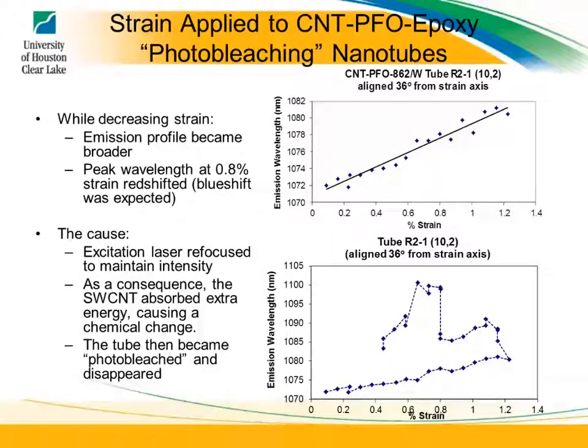Prior people actually put nanotubes into PMMA solution, and they did a study on that, and they saw hysteresis on all of them. A little bit of hysteresis. So if I brought it positive and came back this way, I should be able to bring a negative and come back again. And there's a little bit. That's one of the other things about detecting strain using nanotubes. You want to have a material where if there is any hysteresis, it's almost non-existent. You want to try to limit the hysteresis as much as possible.